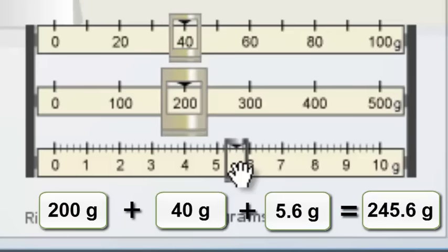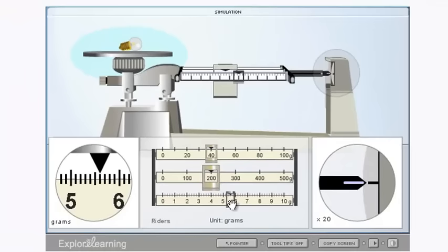That's how you use a triple beam balance and that's also how you use a graduated cylinder to find the volume of something. So those are the tools that we're going to be using and I hope this video was helpful.